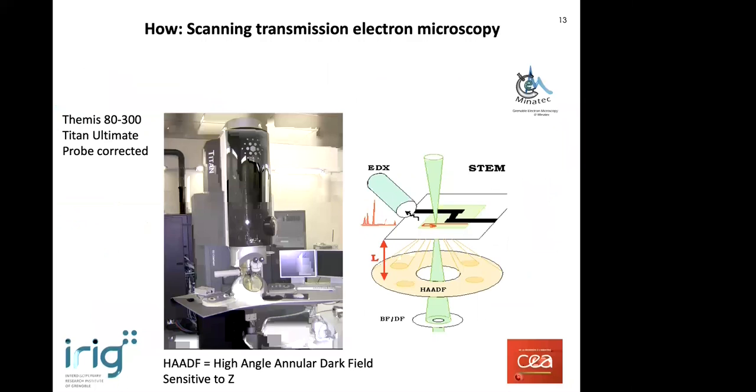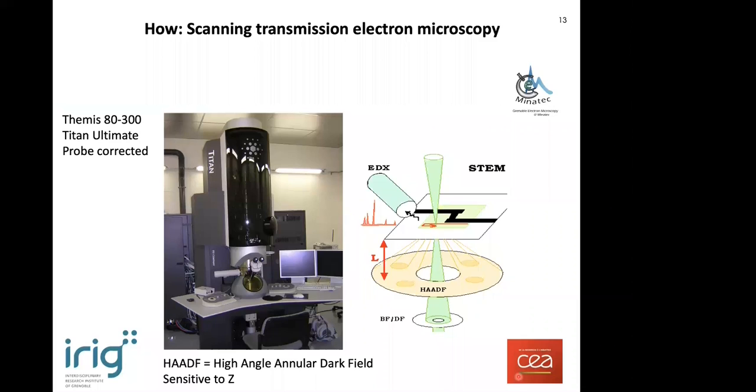Most of the experiments that I will show you in the first 2 parts of the talk are done with scanning transmission electron microscopy. These experiments were mainly carried out in the TEMs in CEA Grenoble in the nano characterization platform inside the IRIG LEMMA group. Here we have a focused electron beam that is raster scanning over our sample point by point. At each point of the scan, we can collect a signal on some detector. For example, we can collect the transmitted disk, or we can collect electrons that are diffused over larger angles or scattered on this so-called high-angle annular dark field detector.